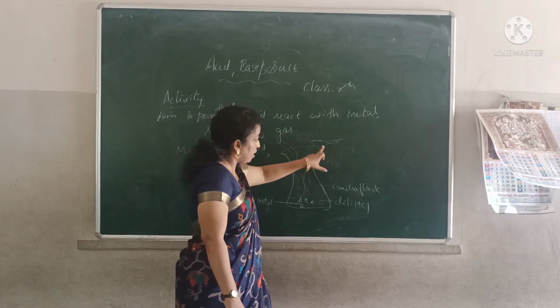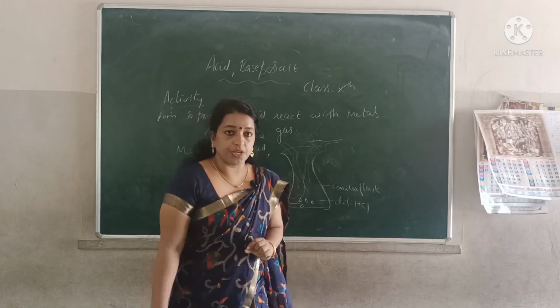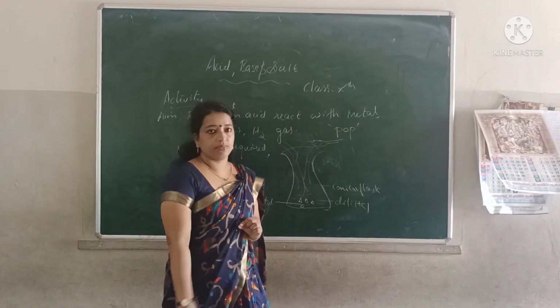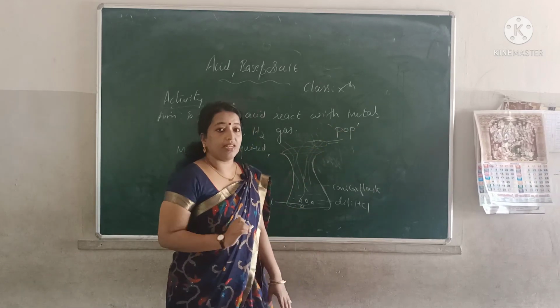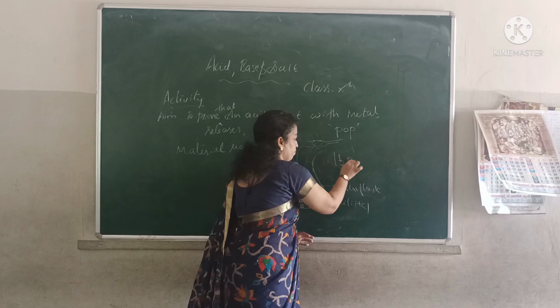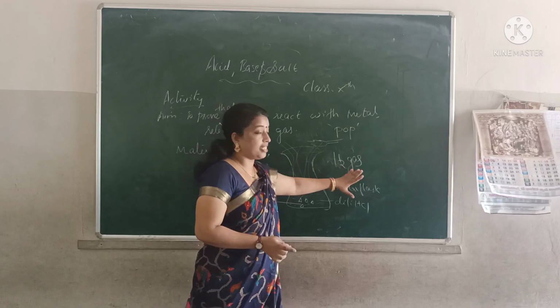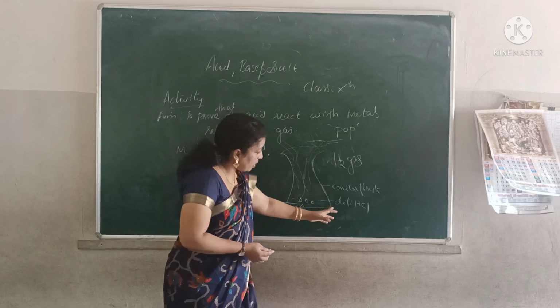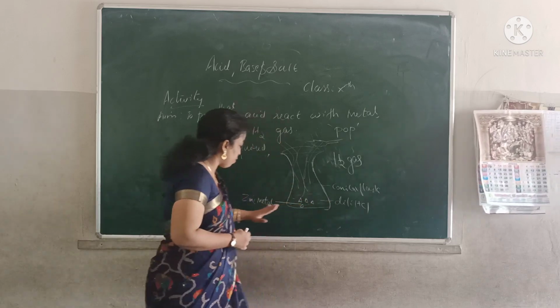When you show the burning matchstick, suddenly the burning matchstick is put off with a pop sound. Then you can tell that the gas coming out is hydrogen. If the burning matchstick is put off with a pop sound, the gas coming out is hydrogen only. Like that we can prove it. Here we have taken only HCl and zinc because the reaction will happen very fast.